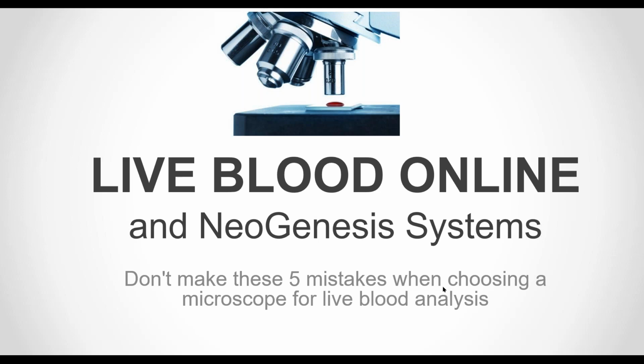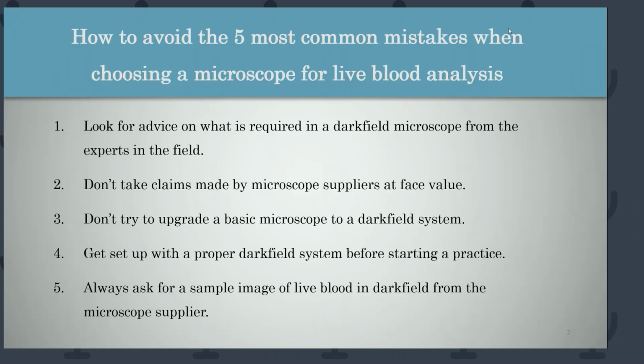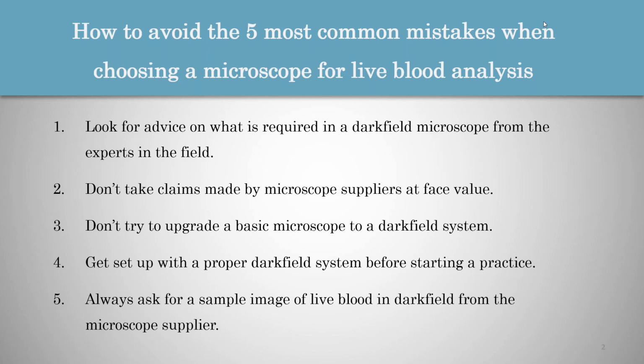Could you please tell us the 5 most common mistakes that practitioners make when choosing a microscope for live blood analysis? All right, absolutely, yes, thank you very much, Elizabeth. Well, there are 5 very common mistakes that we tend to encounter with practitioners signing up for the course and getting set up with a microscope. So we've put together a few points to help attendees avoid these mistakes.